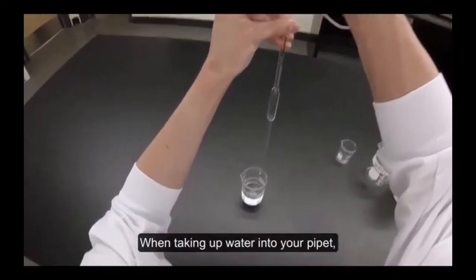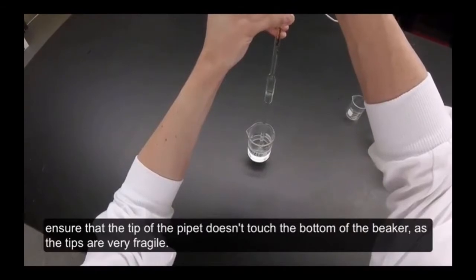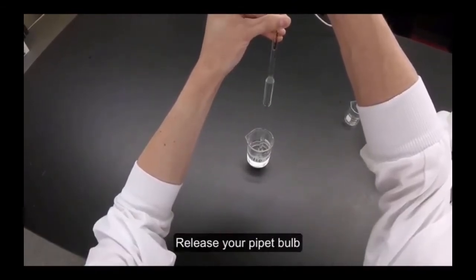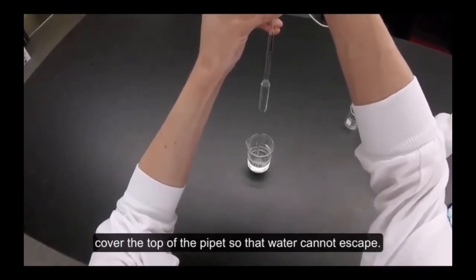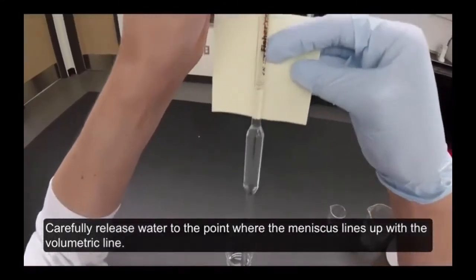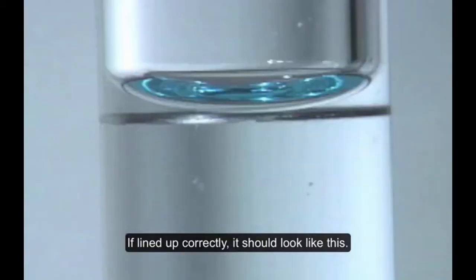When taking up water into your pipette, ensure that the tip of the pipette doesn't touch the bottom of the beaker, as the tips are very fragile. Release your pipette bulb, and using your hand without the glove, cover the top of the pipette so that water cannot escape. Carefully release water to the point where the meniscus lines up with the volumetric line. If lined up correctly, it should look like this.